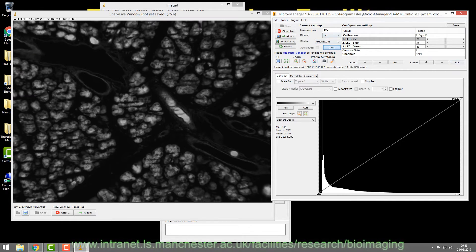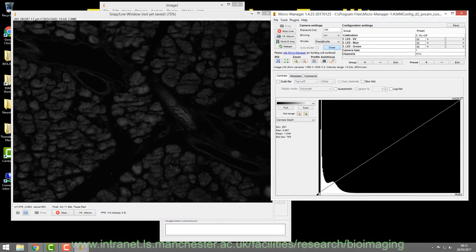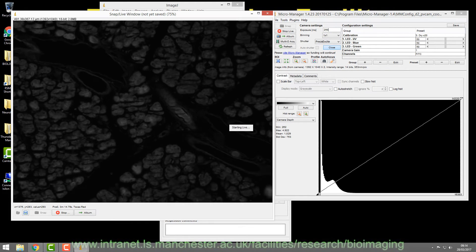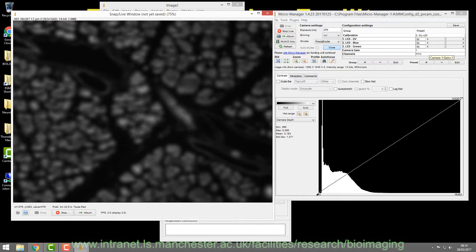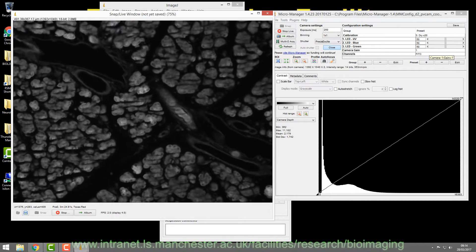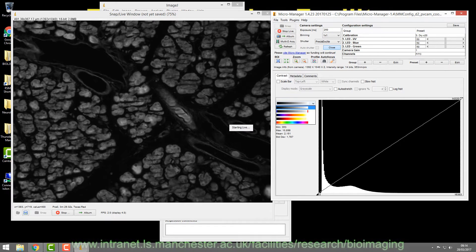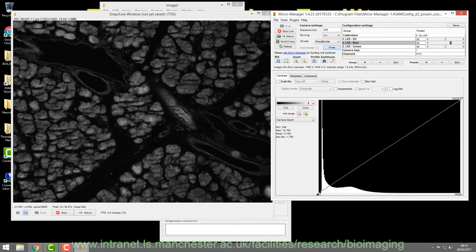Once you're happy with the DAPI exposure, move on to the next channel. Go to FitC — the filter wheel moves automatically. You might set 250 milliseconds for FitC. You can focus and move around, keeping an eye on the histogram to make sure you're not saturating anywhere.